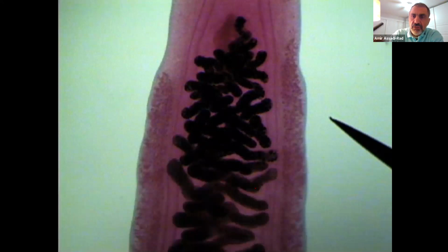Okay, these are yolk glands right here, and all of these are the uterus. And right here, that would be the circle right there. That would be your ventral sucker, oral sucker on top, ventral sucker on this portion of the animal. And then you can see the cecum going down. And I told you, these are all yolk glands or vitelline gland.